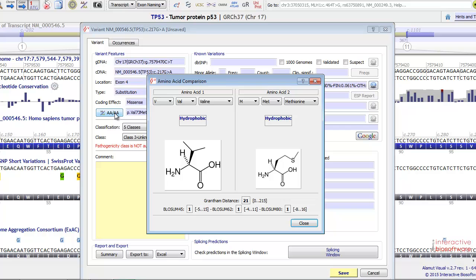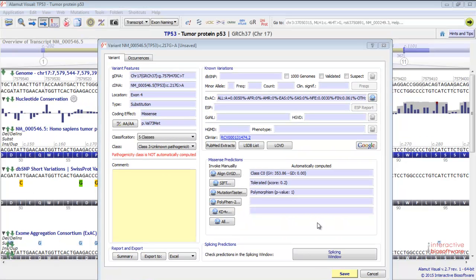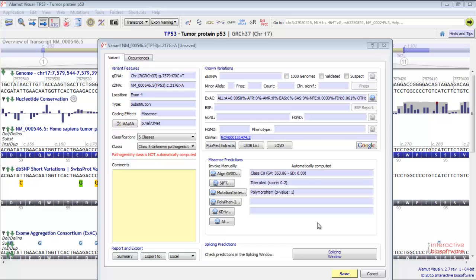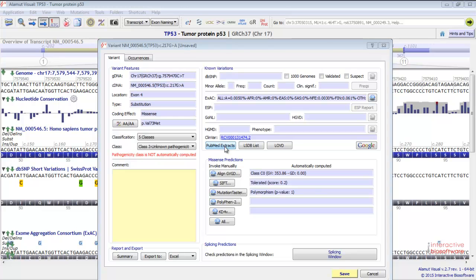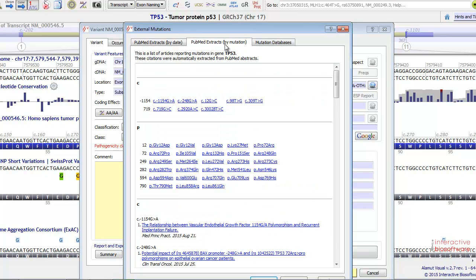With this button, you can compare amino acids between the wild sequence and the mutated sequence. If the variation you've created is known and reported in general populations, you'll have some information indicated here. You'll also have some information from mutation databases such as HGMD, if you have a professional license, or ClinVar. You have PubMed citations here concerning this gene and the mutations in this gene.